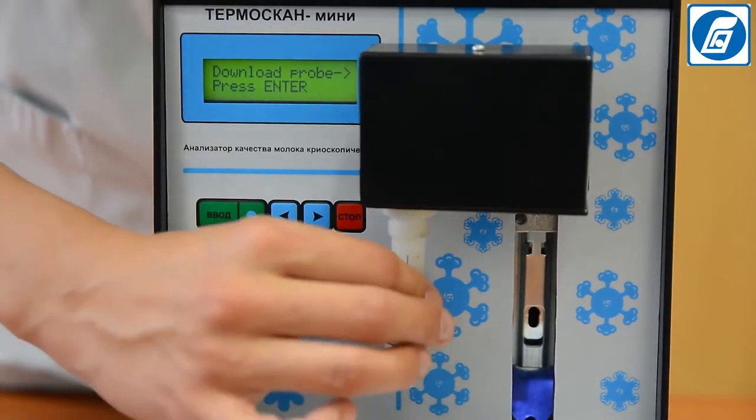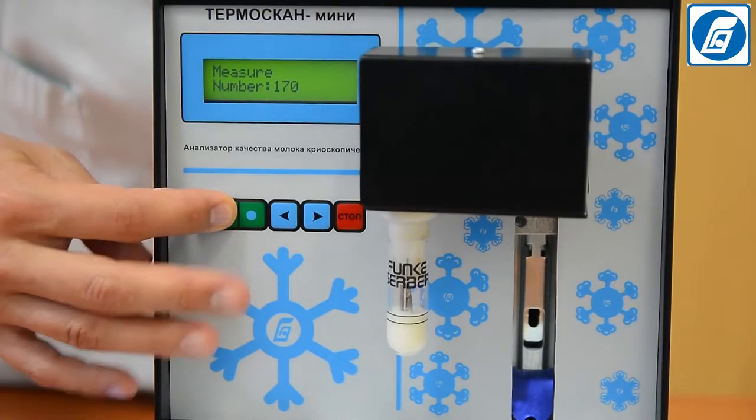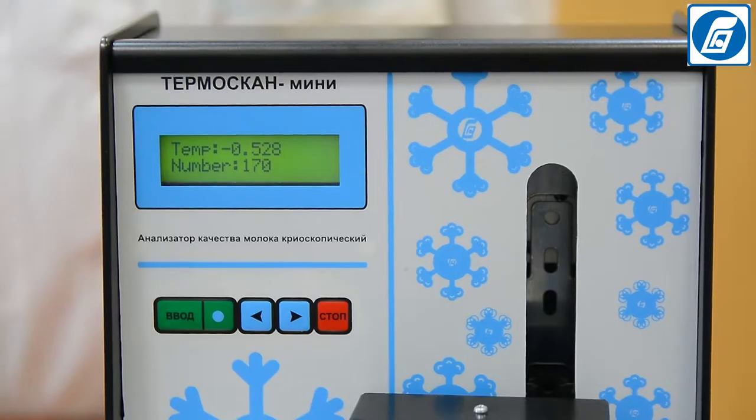Place the test tube with the milk sample on the holder of the measuring head, smoothly pushing it upwards all the way. Press Enter. The test tube with the milk sample will be lowered, together with the measuring head, into the sample receptor of the cooling bath. The cooling process will begin. On completing the measurement, a short sound signal is given and the measured value of the freezing point is displayed on the indicator.